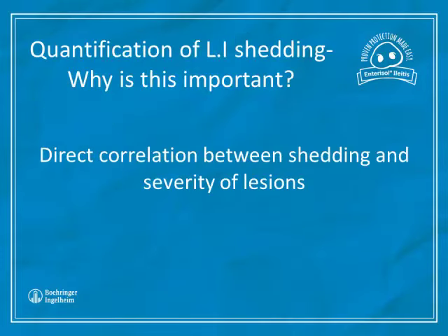So why is quantification of Lawsonia important? And it's because in the literature you'll find that there's a direct correlation between shedding of Lawsonia in the feces and severity of lesions or clinical signs in the pig.